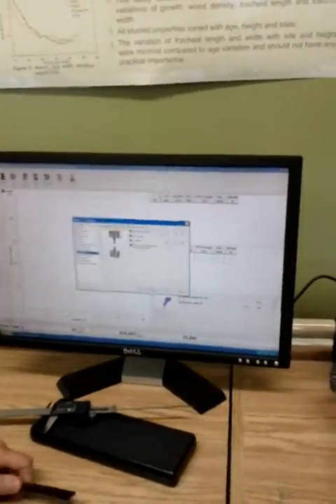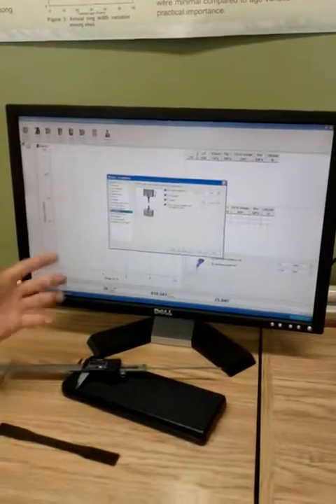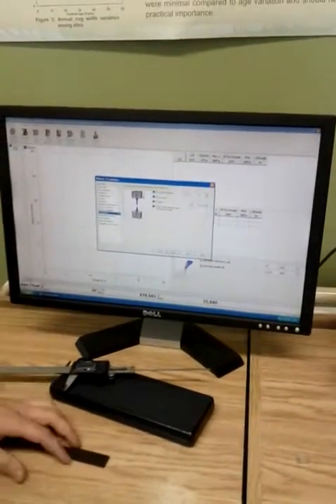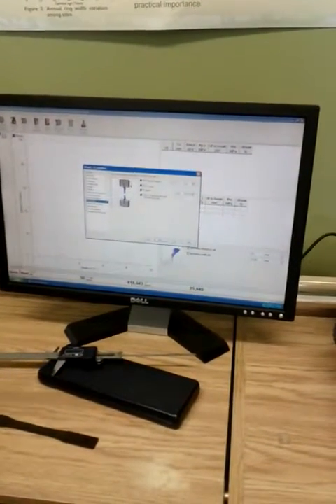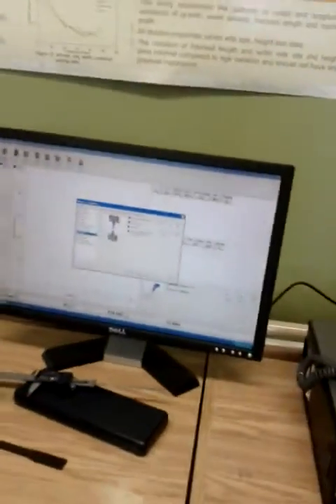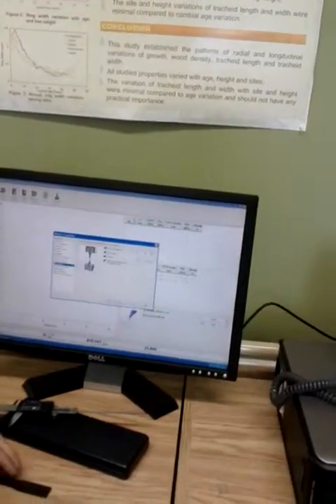LE speed is the speed at which the machine will go back to its position. I put 400 millimeter per minute. It's just because it's per minute. At this point, the test is finished, and it just goes back to this position. It's up to you, but I use this value.